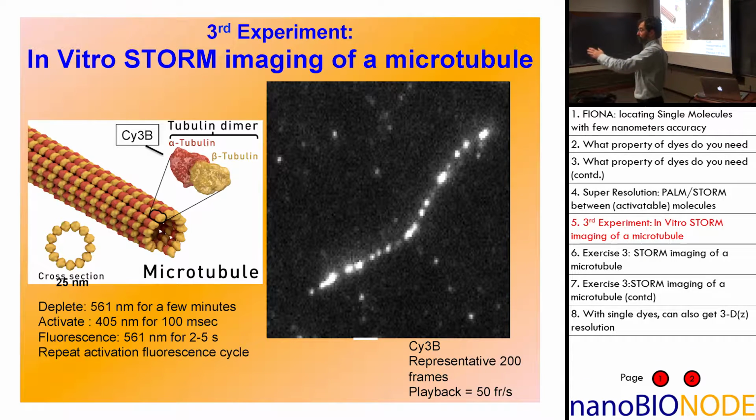That's all. So there's no fancy math involved or anything. When you think you see a single point spread function, then you turn your light down maybe another factor of 3, and then you're pretty sure.